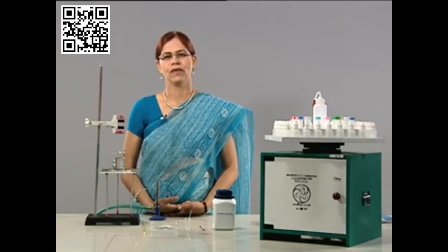Let's do the beautiful. In the previous experiment, we have already performed the boiling point of an organic compound. Now we are going to perform one more experiment, which is again a characteristic of a compound. Let's determine the melting point of an organic compound.